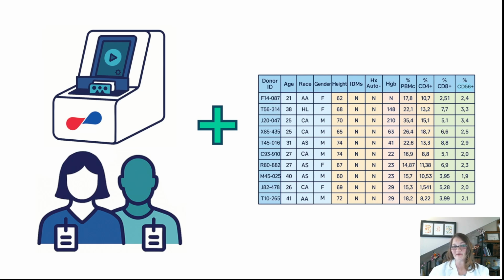So join me on the next episode for a continuation of this discussion: how flow cytometry can help collection centers better serve the cell and gene therapy industry. I'll discuss the use of pre-collection counting and post-collection product evaluation to help create more predictable and reliable starting materials for developers to use in cell therapy manufacturing.